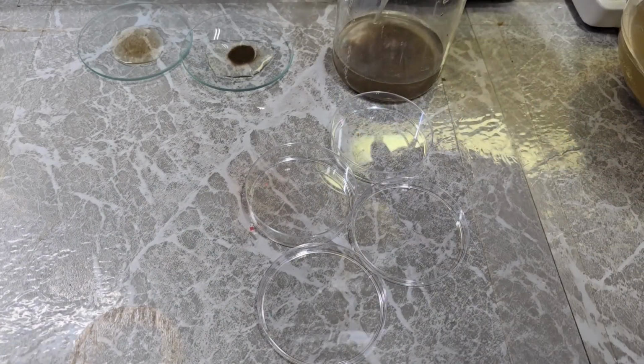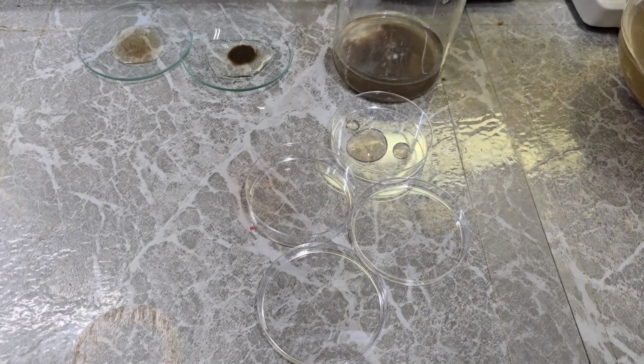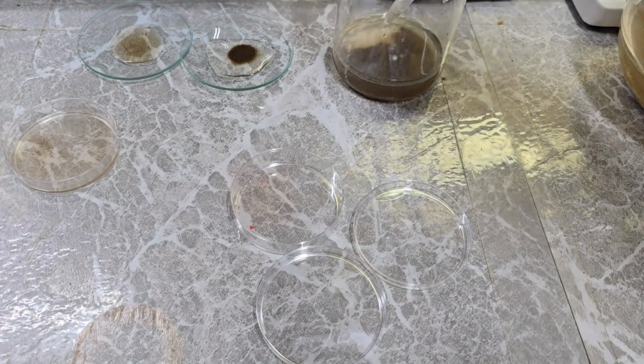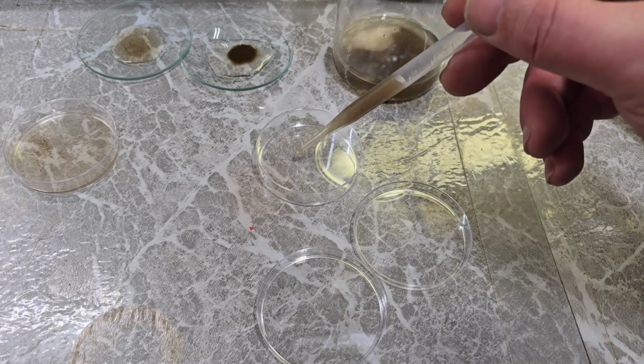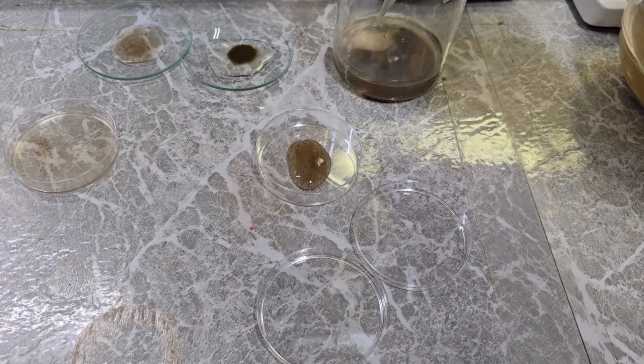You are going to find a lot of different stuff in these whenever you do something like this. You're going to find flatworms and nematodes and little microscopic worms, all kinds of stuff, whenever you're out getting stuff from the wild to look at under the microscope. That's what's kind of fun about it. You never know what you're going to find until you start looking.